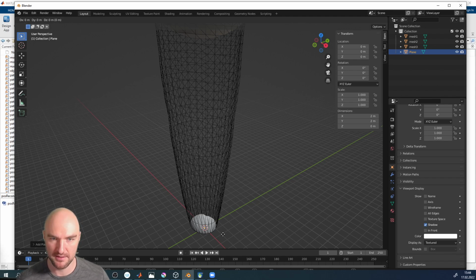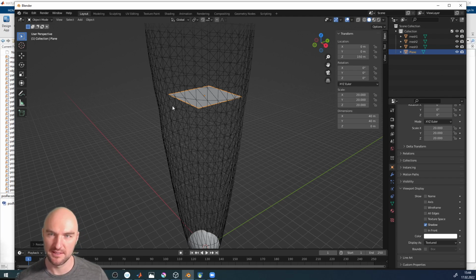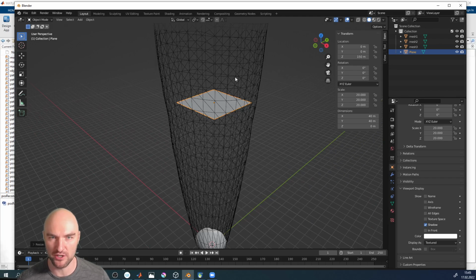We'll grab it in the Z direction, and it says meters, but anyway it's nanometers, you all know that, and I'll put it at 150 nanometers in the Z direction. By pressing S I can scale it up, to 25, 30, doesn't really matter. So put a scale of 20 onto it. Now it's 40 nanometers across, and it just lives in there, a plane in our reconstruction.